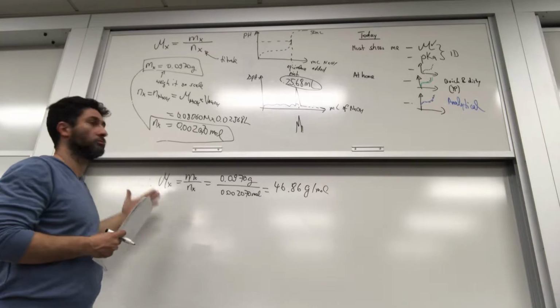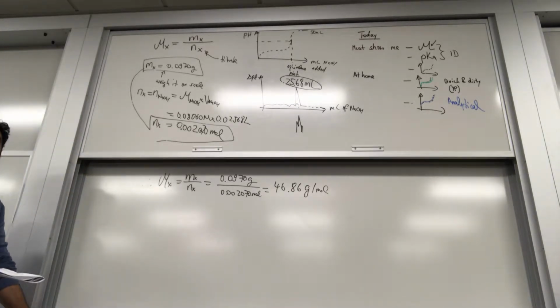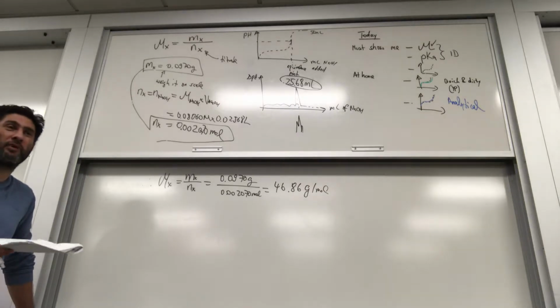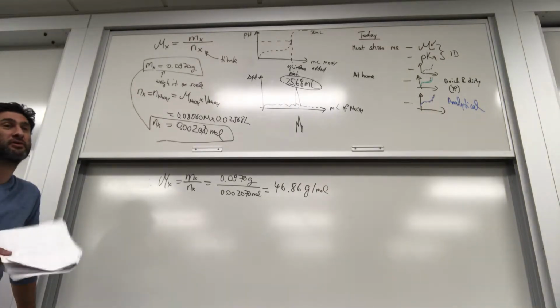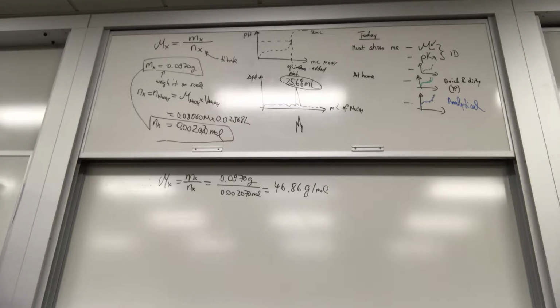So the NaOH is the number of moles of the acid, and the number of moles of base at equivalence. Well, at the equivalence point, that's the point of the equivalence point, right? They're equal according to the stoichiometric ratio, which in this case is 1-to-1. Right? That's the trick here. Okay. Any other questions?